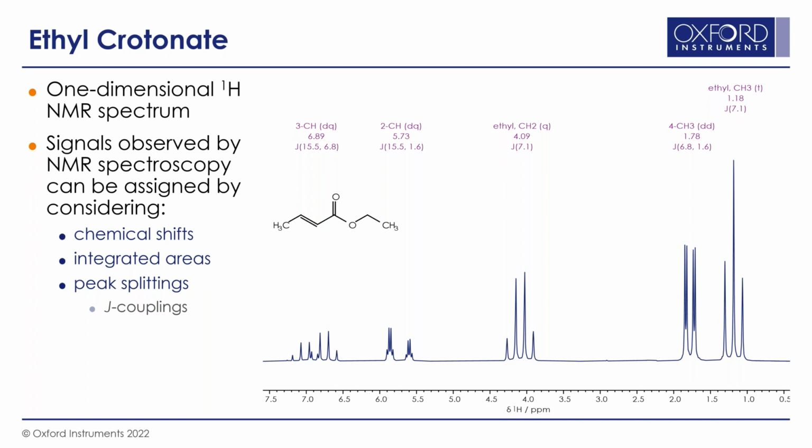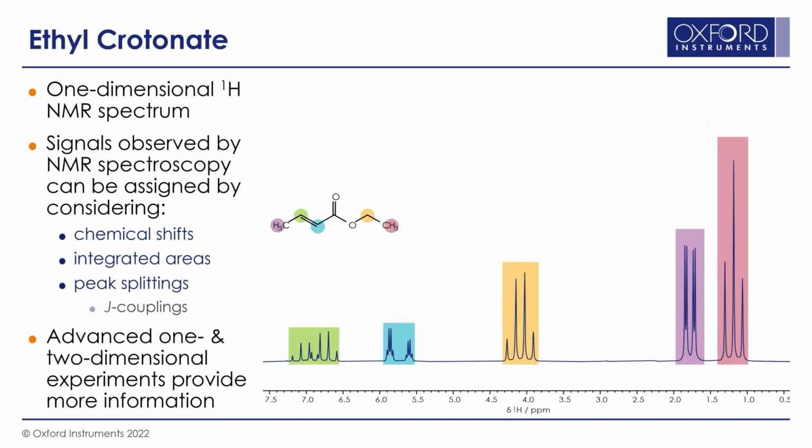On a 60 MHz instrument like the X-Pulse, this is a width of around 2/5 of a ppm, while on a 500 MHz high field instrument, this would be around 1/20 of a ppm. This difference leads to some of the clearest visual differences between NMR spectra obtained at various field strengths.